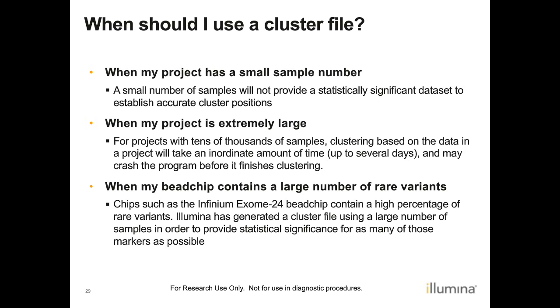If your project is extremely large, for projects with tens of thousands of samples, if you took all tens of thousands of samples in your project and asked GenomeStudio to cluster the data based on the data in this project, it could take potentially an inordinately large amount of time, from several hours to several days, and it may indeed even crash the computer or the program before the clustering is finished. So you'd want to use an existing cluster file for projects which are extremely large.